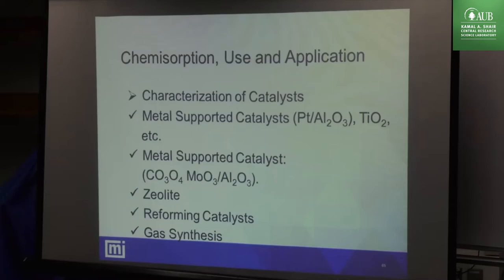Really, these five or six molecules are widely used everywhere to determine the dispersion of active species. Only ammonia measures the acidity, or acid sites. As I said yesterday, the metals are not always the active site; the acid site could also be the active site, in the case of, for example, zeolite. So we characterize this acid site with a base molecule such as ammonia.